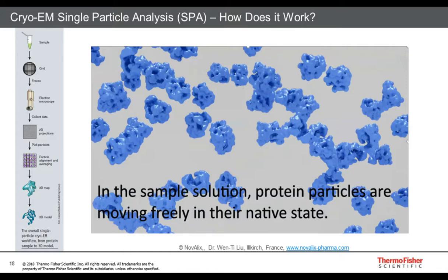So that was actually a nice animation on single particle. So what happens if you would digest the various sections and put them into perspective, and you start with a biochemical component, where you purify the sample, as I said, then you try to vitrify the suspension that you would like to investigate by using the Vitrobot.